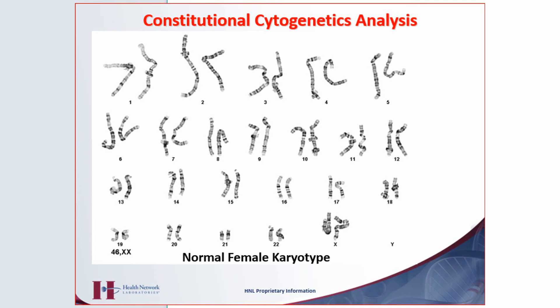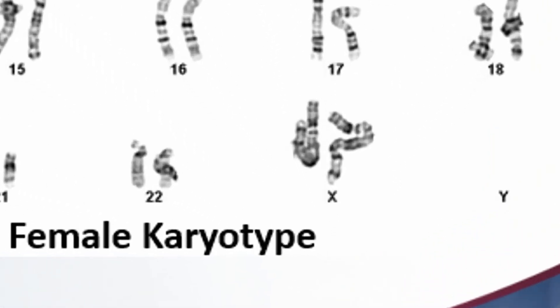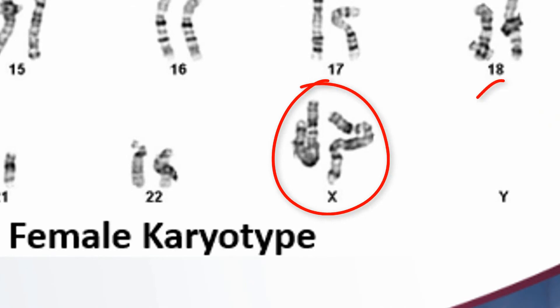This is a normal female karyotype. You know that because it has two X's and no Y's — you can see the Y slot is empty. Normal female.